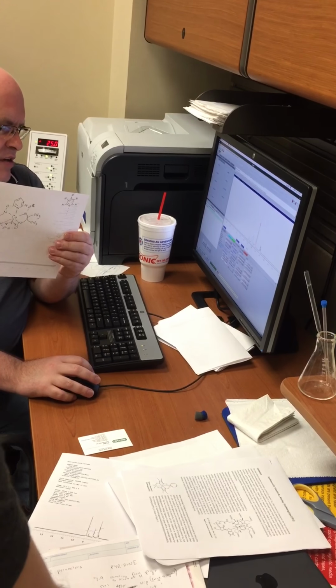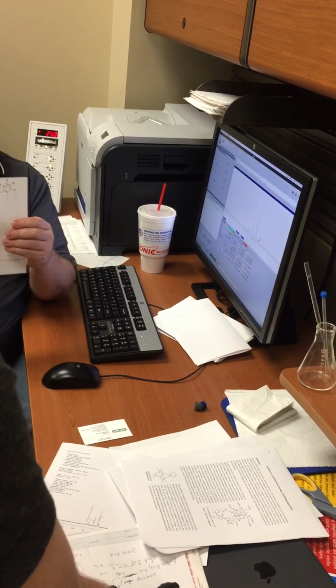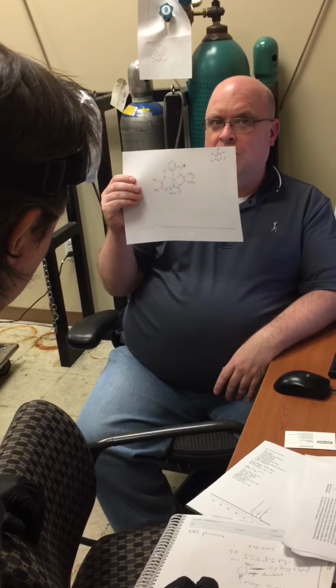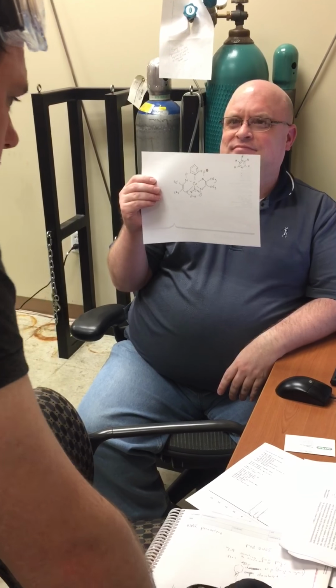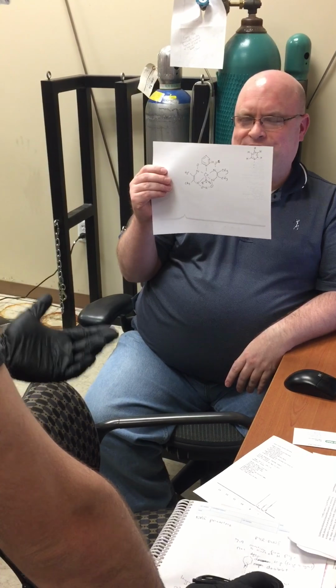Now, we also have this little weird-looking thing right here. It's supposed to be a quintet. It doesn't look like a quintet because the shimming is off a little bit. But it is a quintet. If you look in the structure, there is nothing that's next to 4 hydrogens to give a quintet. But what do you have in your NMR tube besides your sample? Solvent.